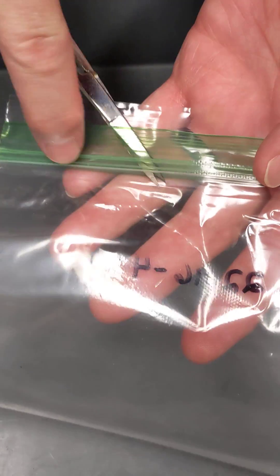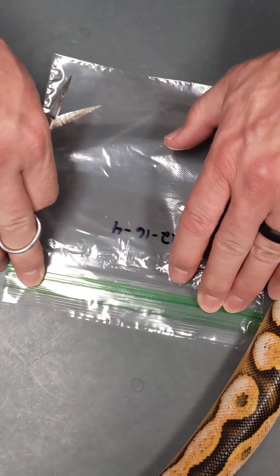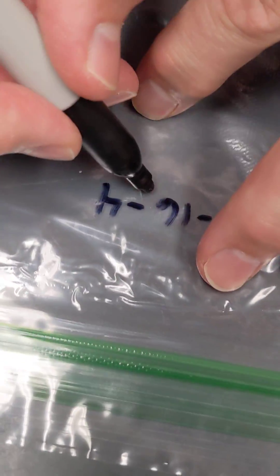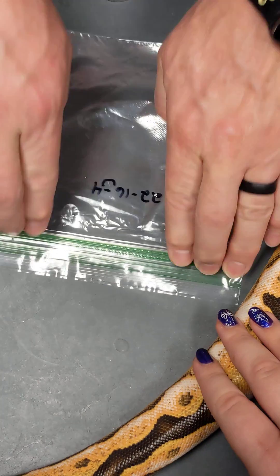Just put this in the bag — and you can see it right there. There we go. I've already got it labeled with the animal number, seal that. And then what I like to do — of course it might move — but I just like to kind of mark where the scale clip is so that I can find it later.